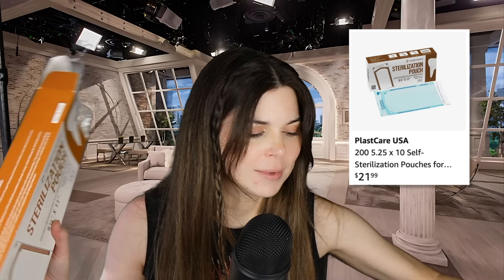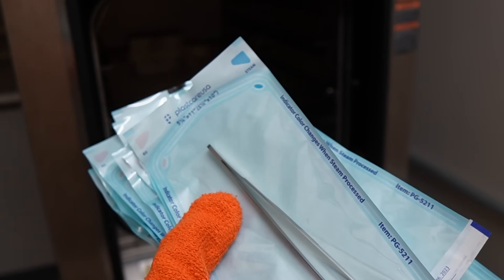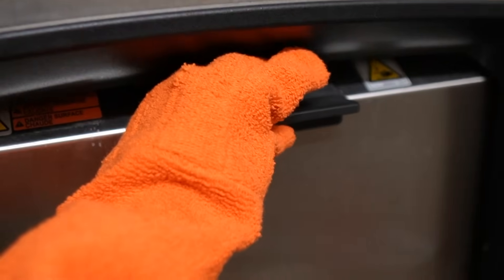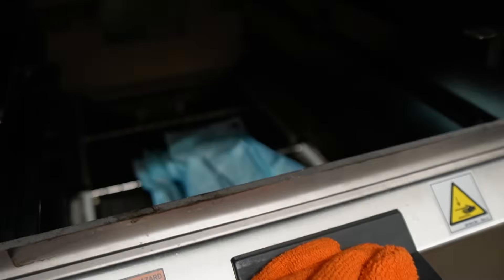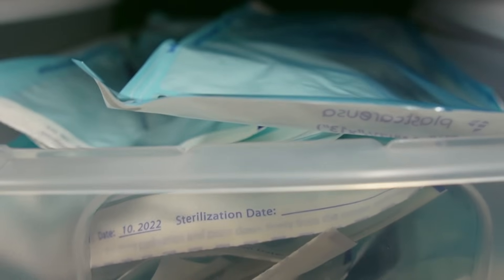The forceps, scissors, and trays can all be autoclaved. To do that, I put them inside of these sterilization pouches. I have two sizes — the smaller ones I use for the forceps and scissors, and the larger ones get used for the trays. These pouches just keep everything sterile until I'm actually ready to use them. That way, I'm able to sterilize a whole bunch of forceps and scissors and trays at once, so I have them ready to go when I need them.